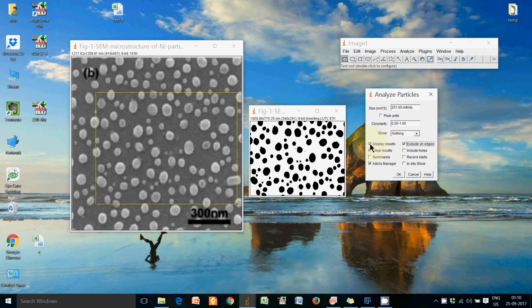Click this box also to display results, clear results and add to manager. Another thing is size, circularity and show. Here a lot of options are available. We can choose nothing, or outlines. We will select only outlines here.